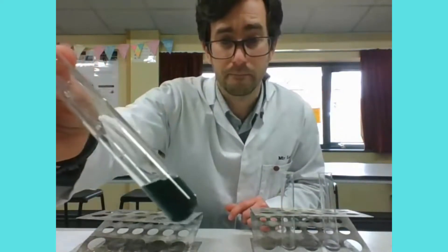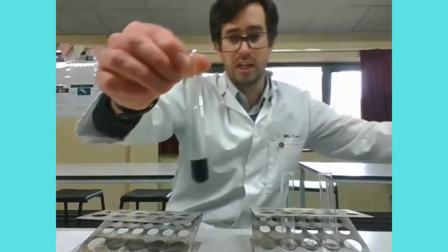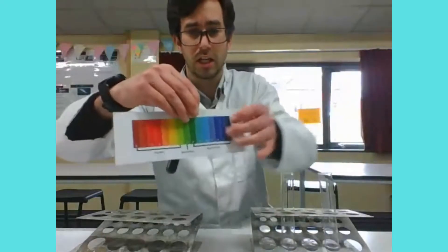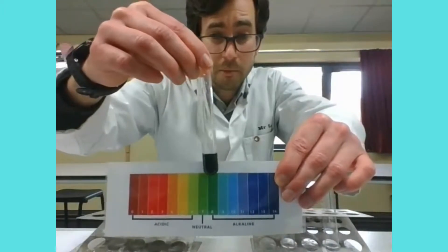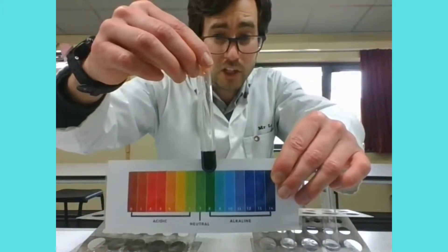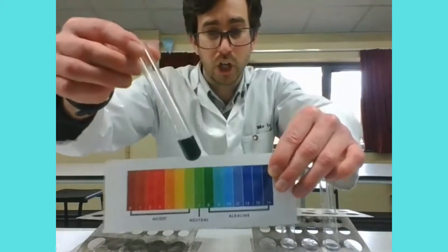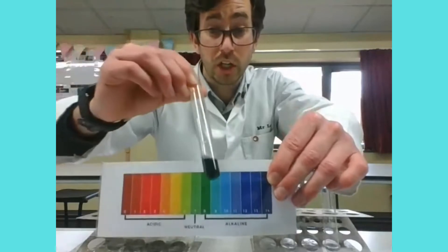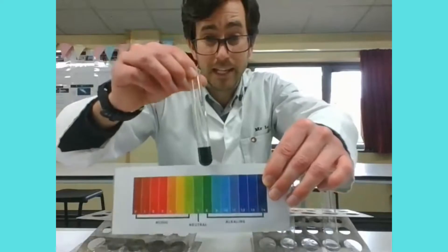I put a few drops in and we can see it's still quite a dark green color. I've got a pH chart here — let's see where it matches up. It's probably not neutral; it is a little bit darker, so perhaps around pH 8. Has it gone quite to pH 9? It's a bit hard to judge, and when we're judging colors it's often quite subjective as to what the exact pH is.